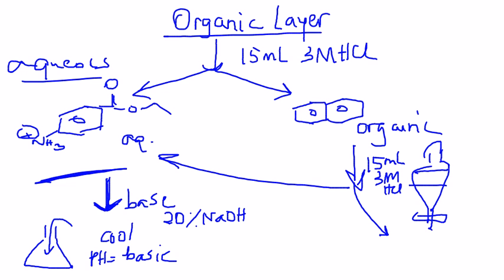So again, as you add sodium hydroxide, you will see that a white solid will appear and then disappear. You have to keep adding till it persists, and you will see that the pH paper will show kind of a blue color, a teal color almost. You should cool it down, and then do the same thing you did with benzoic acid. So you will filter it, and you will then find out the melting point of that.